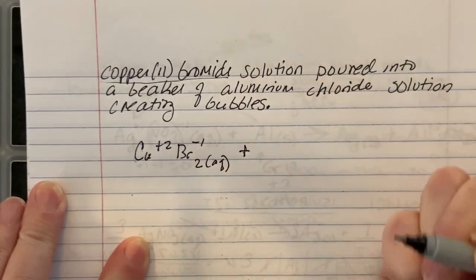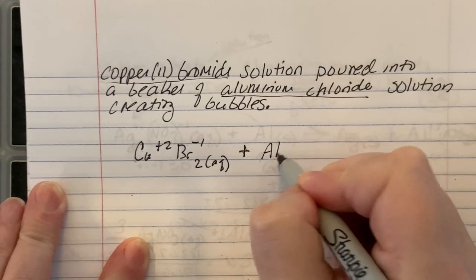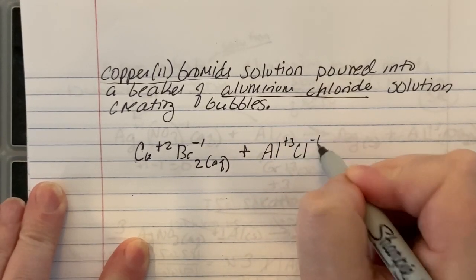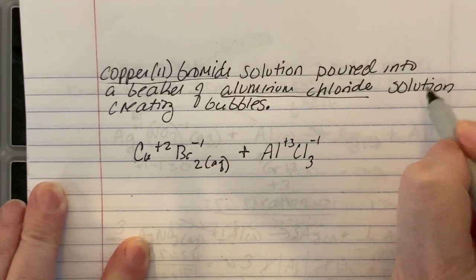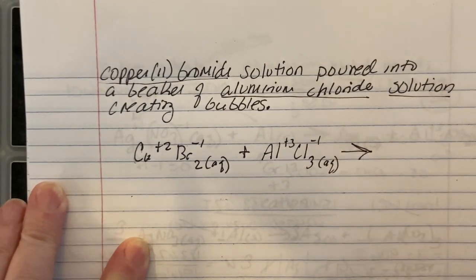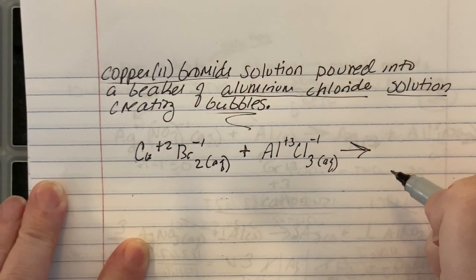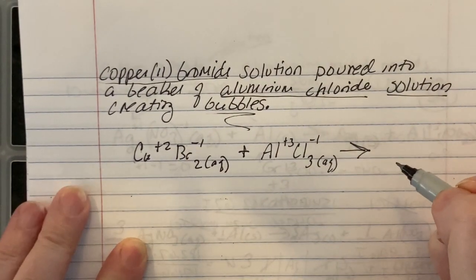Okay, so it's going to be mixing with that beaker of aluminum chloride, Al plus 3, Cl minus 1. And that again is a solution, so aqueous. Creating bubbles. So now we know that there's a reaction. So I did a reaction arrow there. We're yielding some new products.